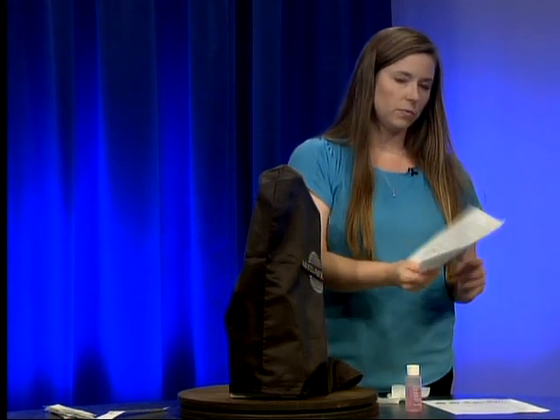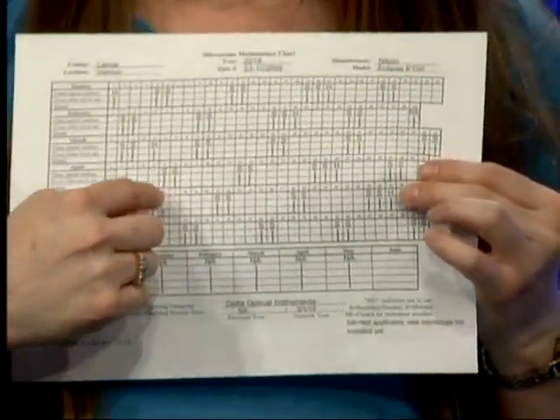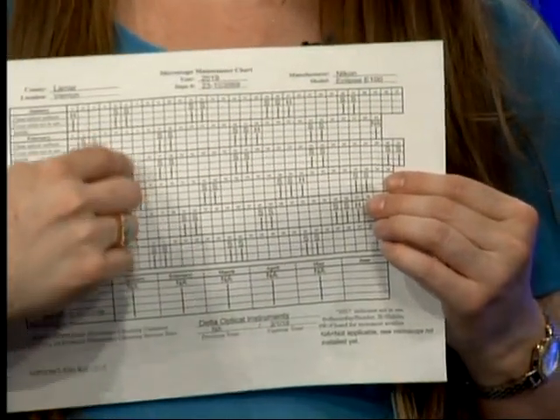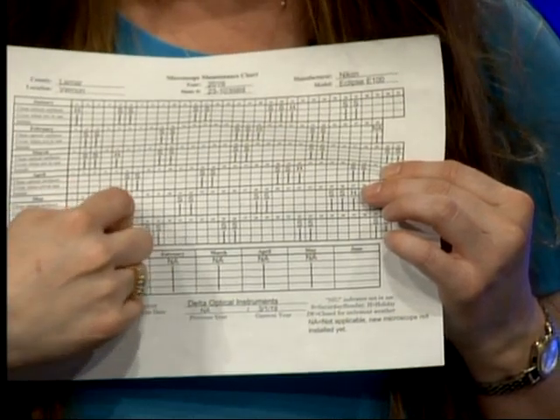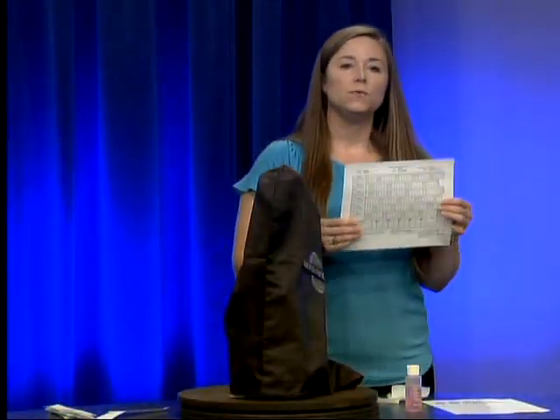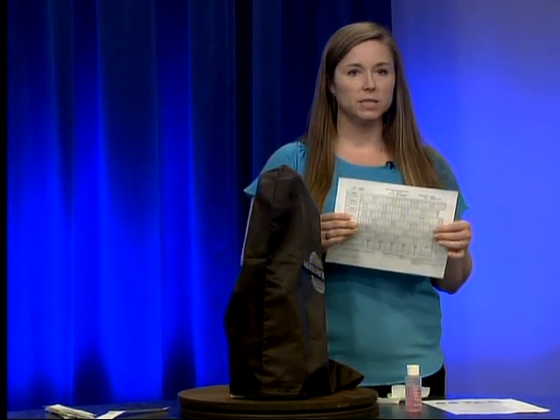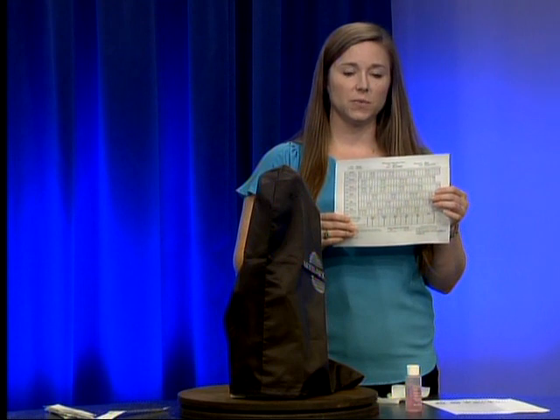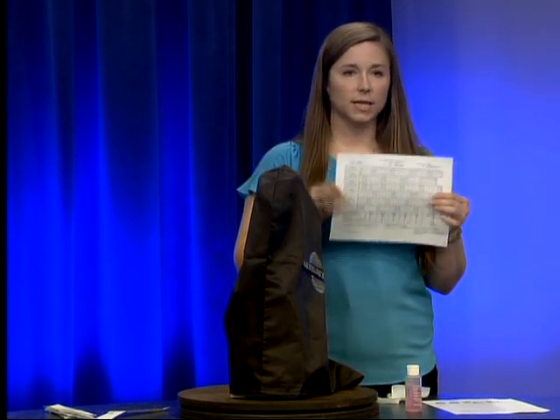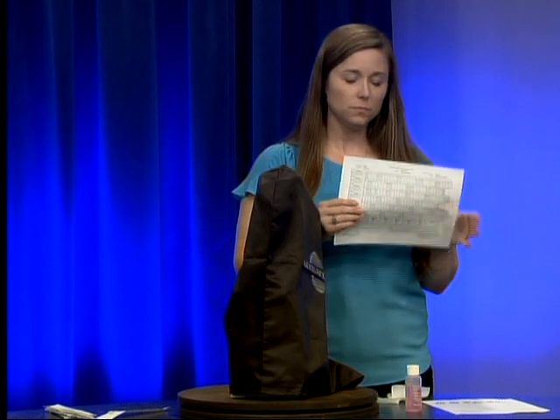On the microscope maintenance chart, find the day you just did the cleaning and check the top box confirming you cleaned the optical surfaces, then check that you covered the microscope when not in use, and put your initials in the bottom box. If you didn't use the microscope that day, write NIU in that space. There should never be any blank spaces on your charts — that generally indicates something was missed. Saturdays, Sundays, and holidays are already filled in for you.